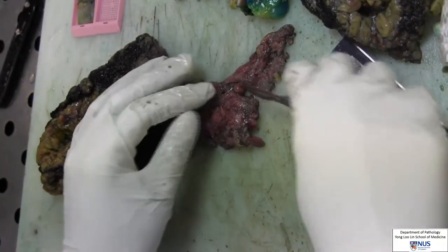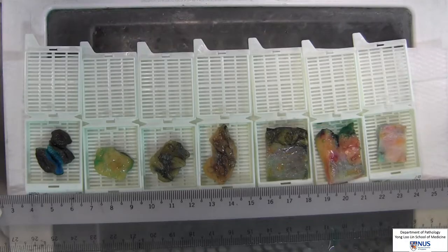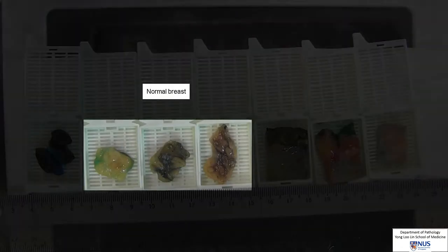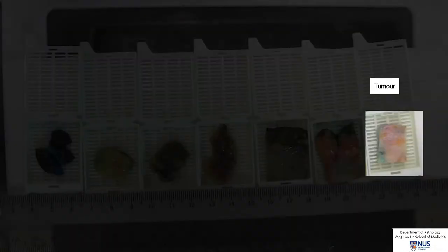Lymph nodes from the axillary tail will be sampled as well. Here we have the sections on cassettes ready to be sent off for processing into microscopic sections. To recap, here's the nipple, normal breast tissue from the 3 uninvolved quadrants, tumor with superior and posterior margins, and a sample of pure tumor tissue.